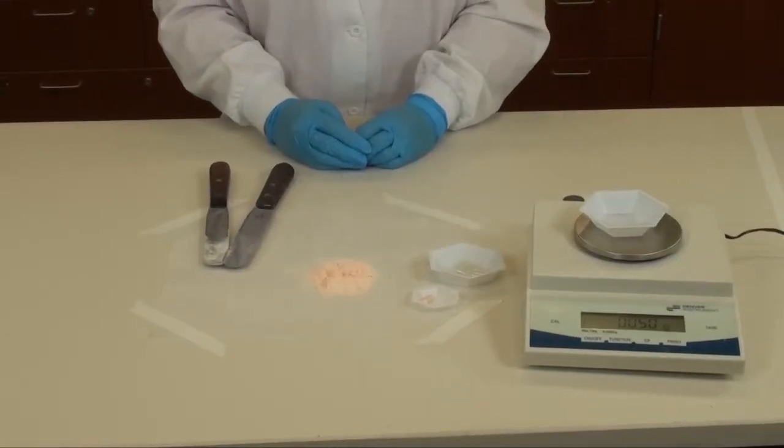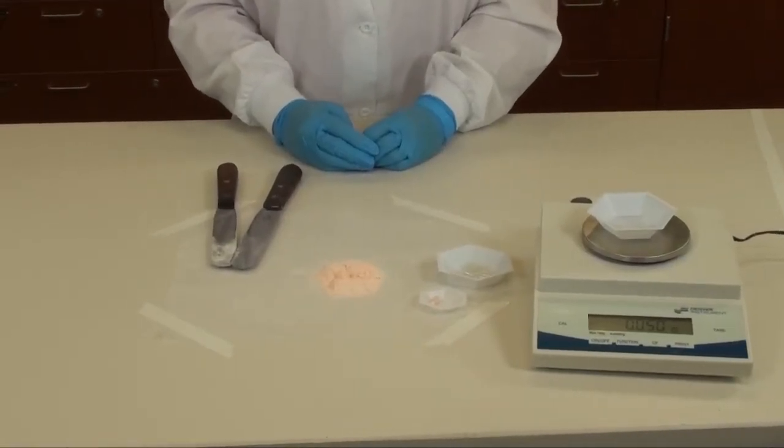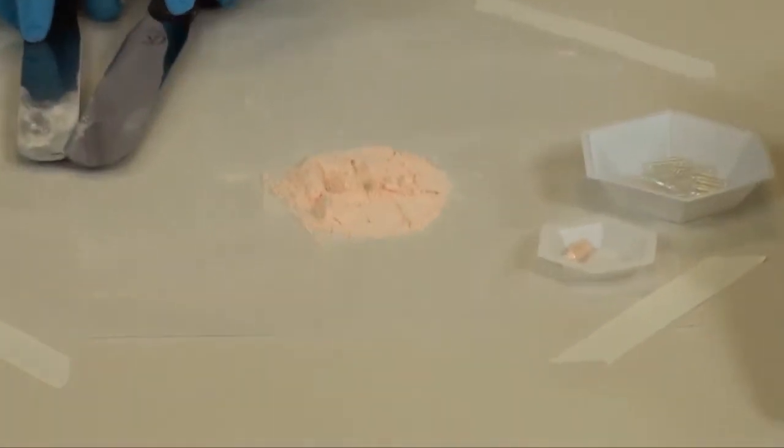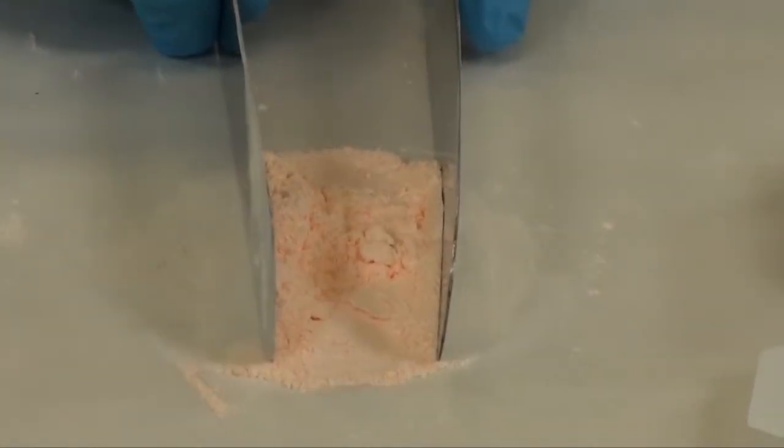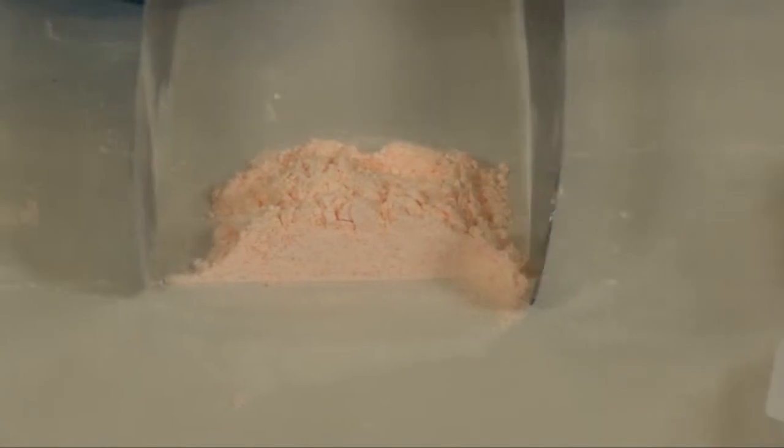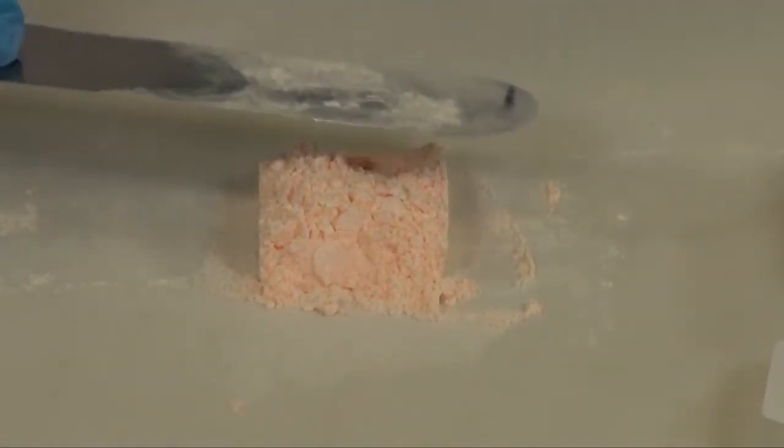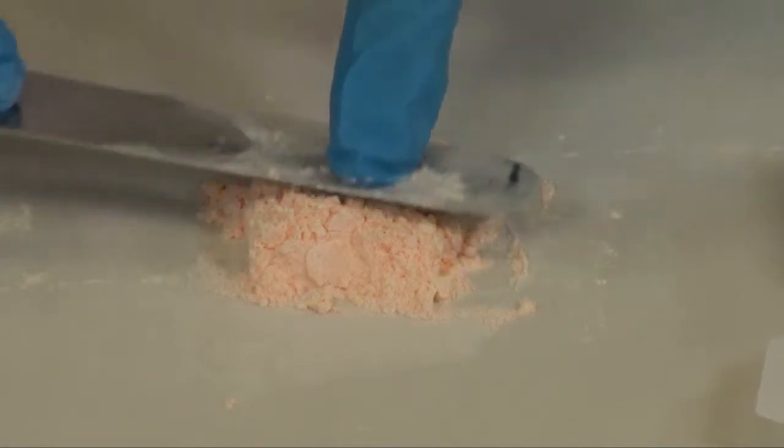Before we can punch our second capsule, we need to re-block our powder bed into a firm, compact bed. So using the two large spatulas again, re-block the powder into a square or rectangle, and then using one spatula, press it firmly down again.